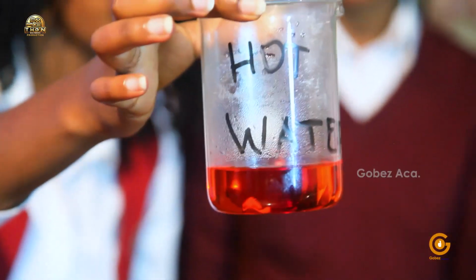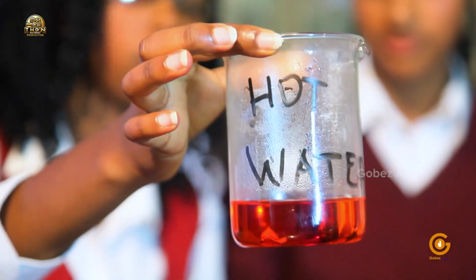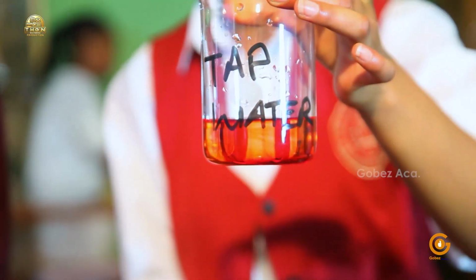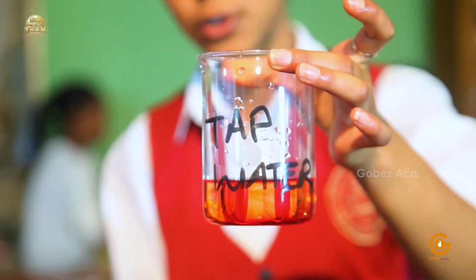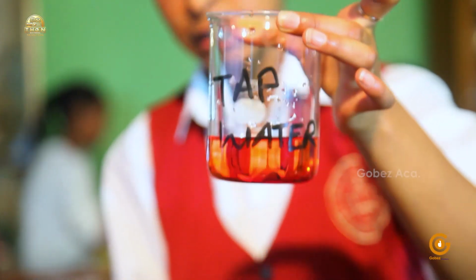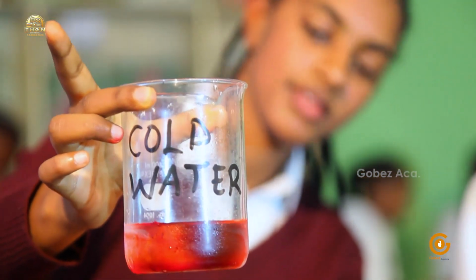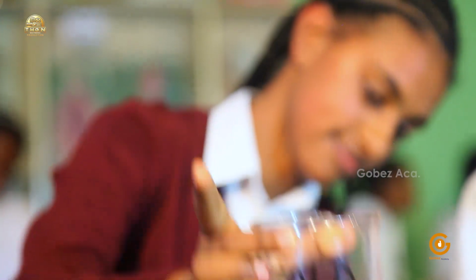It has now been 30 seconds and we have seen the changes as they occurred. We can see that in the hot water, the molecules diffuse the fastest. In the case of the tap water, we observe that the colored molecules diffused moderately fast. As in the case of the cold water, it's diffusing the slowest.